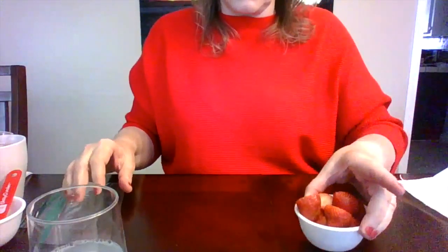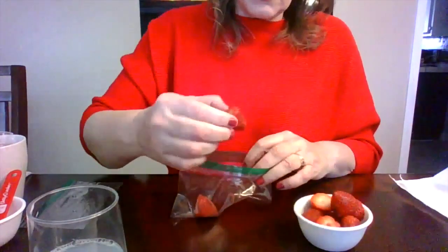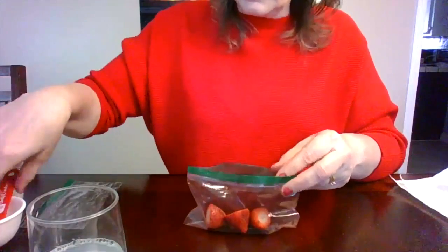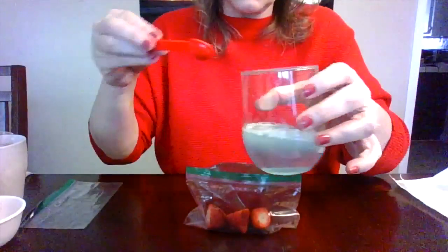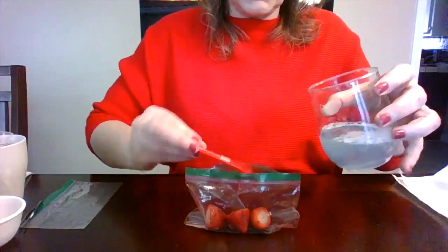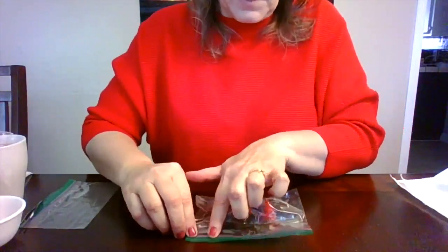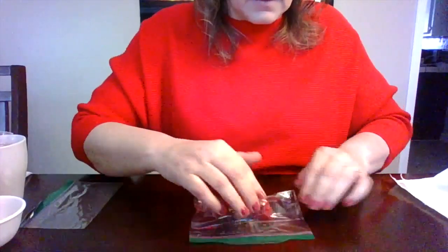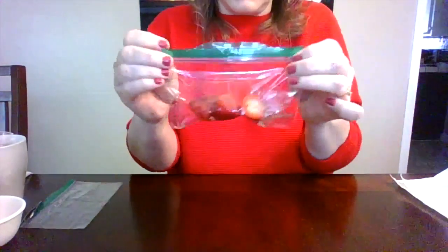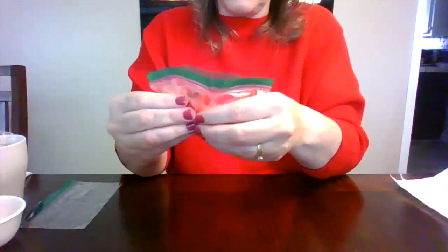Now let's look at the strawberries. Put about three medium-sized strawberries into your Ziploc bag. Take two teaspoons of the extraction mixture we made and add it to the bag. Seal it up, making sure all the air is out, and make sure it's nice and sealed because now we're going to do some smashing. Mush up the strawberries until there are no large pieces.